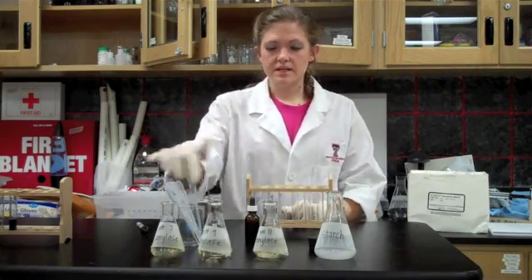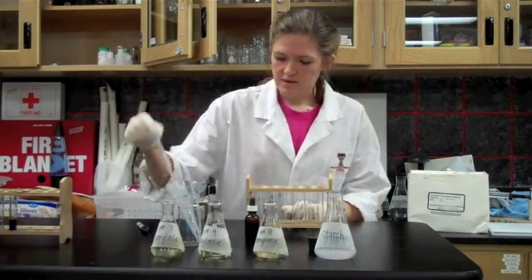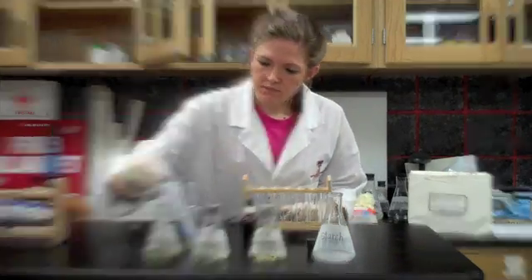I'm going to take one milliliter of each of the solutions and put them in the test tube that I've labeled for each one of them. I'm going to start with the pH of seven.